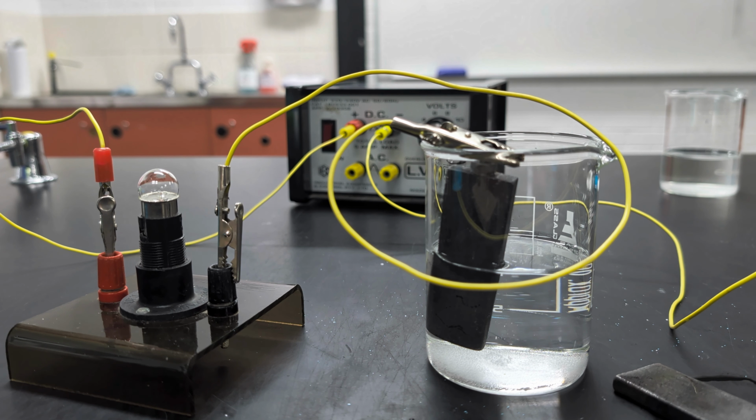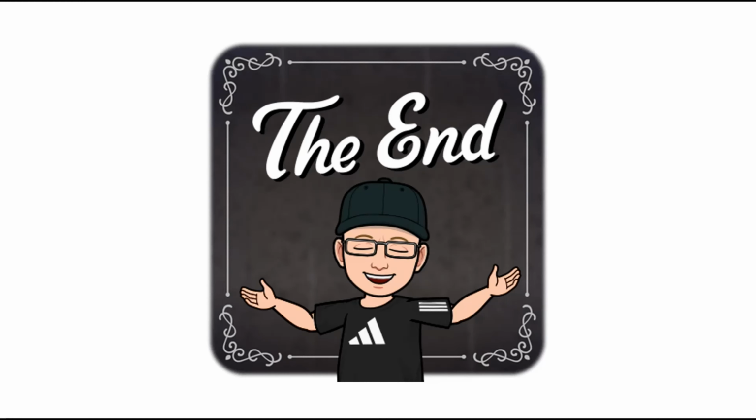So there we go. Sugar doesn't conduct because it's not ionic, but the two ionic compounds we looked at, hydrated copper 2 sulfate and sodium chloride, when we have ions in solution, they are free to move, they will conduct current. Well, that's the video done.